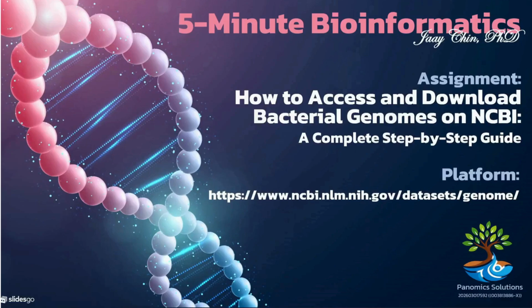In this assignment, you will learn how to access and download bacterial genomes using the NCBI database. This complete step-by-step guide will walk you through the entire process, from searching for a specific bacterial species to retrieving the full genome sequence. By the end of this tutorial, you'll be able to confidently navigate the NCBI platform and download genomic data for your research or bioinformatics analysis.